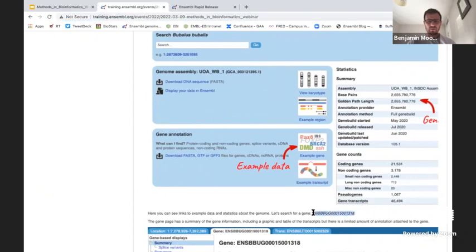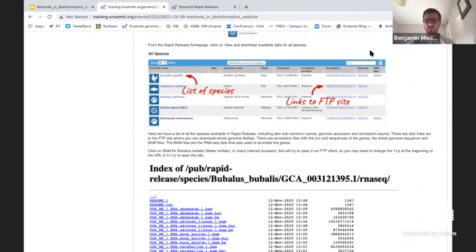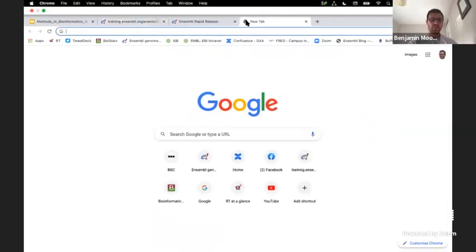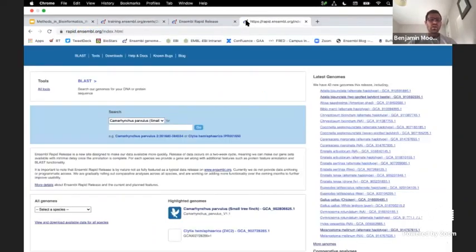So if you want to follow along, I'm going to navigate to rapid.ensembl.org. Please feel free to follow along with me. You can either watch and listen, or you can open up a new tab and try to copy what I'm doing and explore for yourself as well.